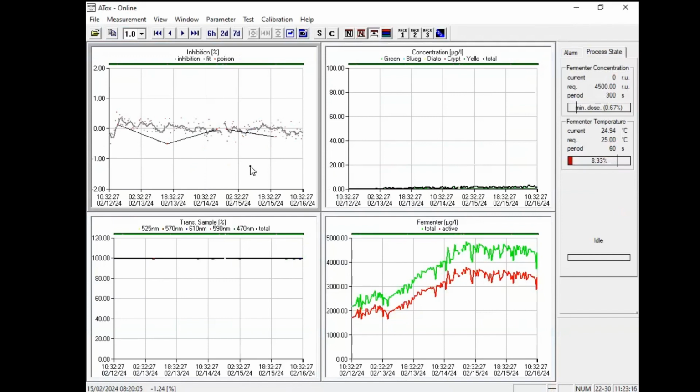So the question is whether you have chlorinated water, and I think in warmer regions and more tropical regions, you have increasingly the chlorination. If it's at a low level, I think you can work with it, but there's a big range which is possible. So it has to be checked, let's say.